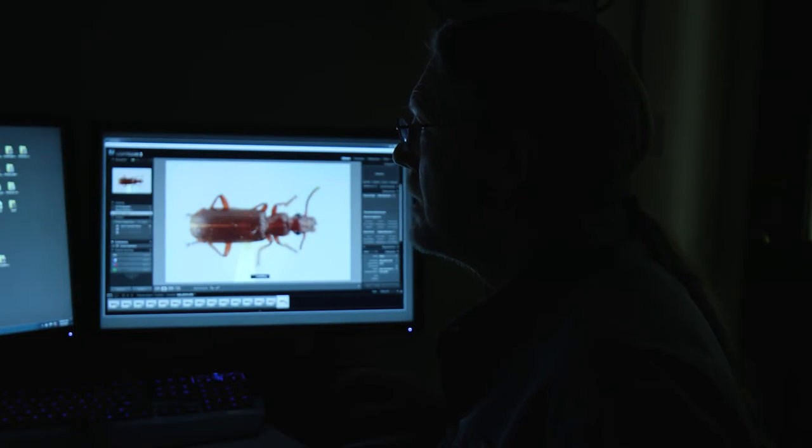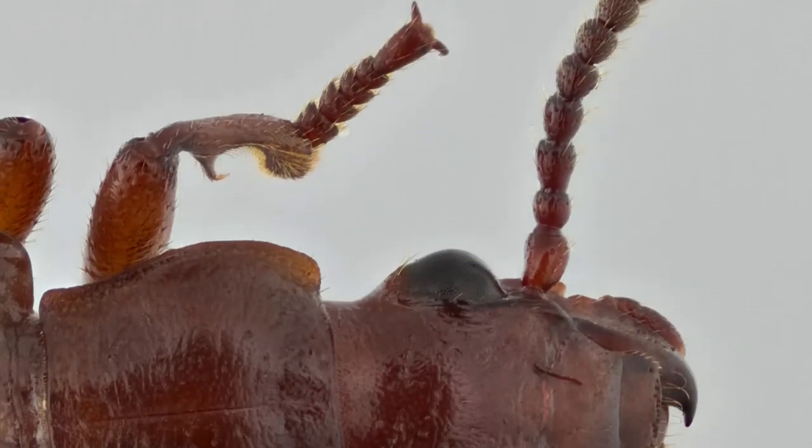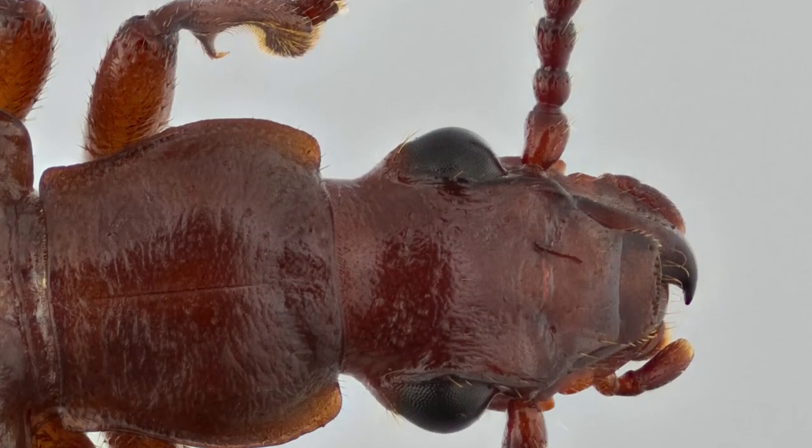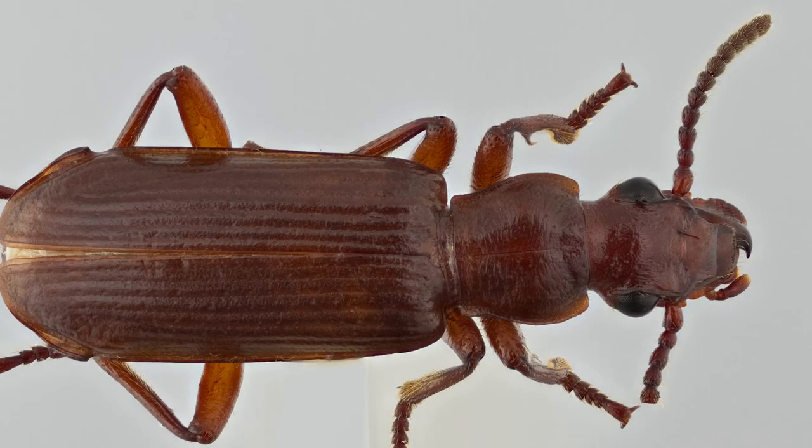Software is then used to assemble all the parts of those images that are in focus, dispose of the parts that are out of focus, and you wind up with these really beautiful images with great depth of field for a very, very small subject.